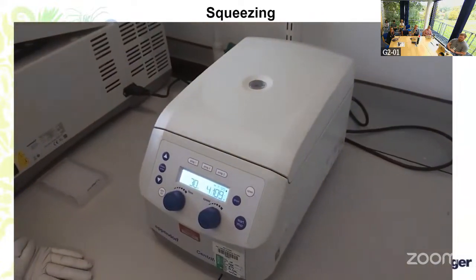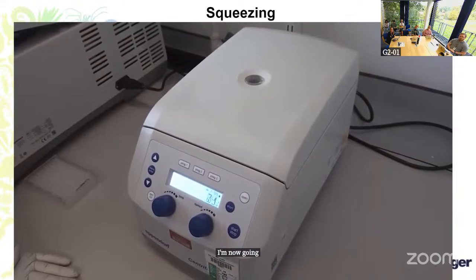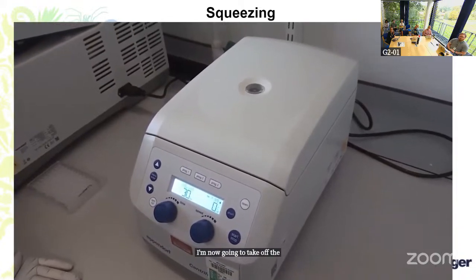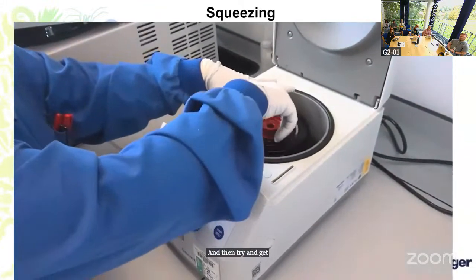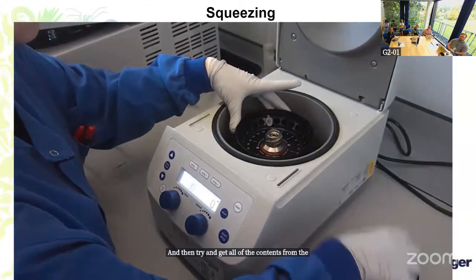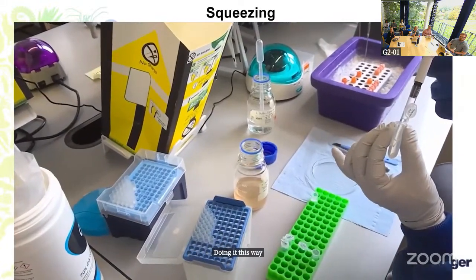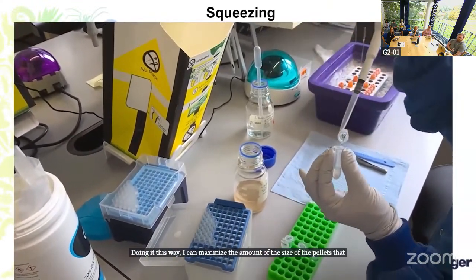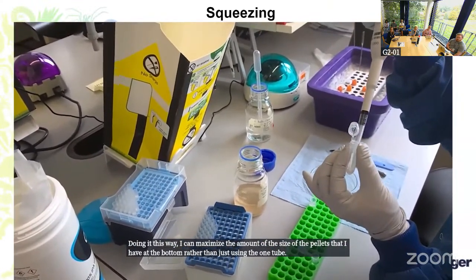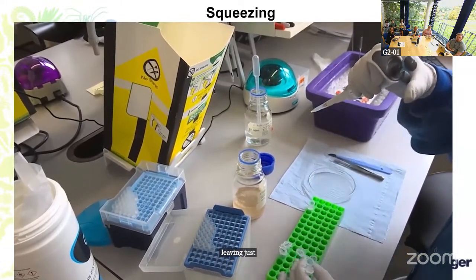Once this is complete, I'm now going to take off the waste off the tubes, and then try and get all of the contents from the second tube back into the first tube. Doing it this way, I can maximize the size of the pellet that I have at the bottom, rather than just using the one tube. So the waste is taken off, leaving just the pellet undisturbed at the bottom.